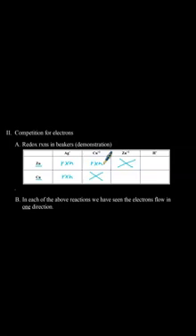Reaction between copper metal and zinc ions, no visible change was observed. So those substances did not react with one another. Kind of hard to see, but as I mentioned, when you place zinc metal in the solution of hydrochloric acid, there were some bubbles. Hard to see through the camera, but I definitely can see them. So a reaction does occur between zinc metal and H plus ions. There was no visible change that occurred when the copper metal was placed in a solution of hydrochloric acid.